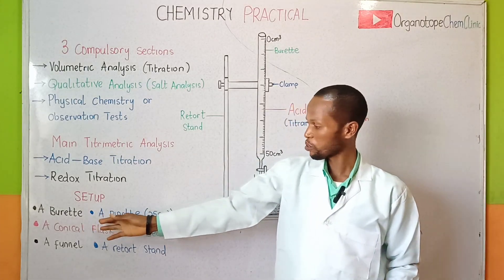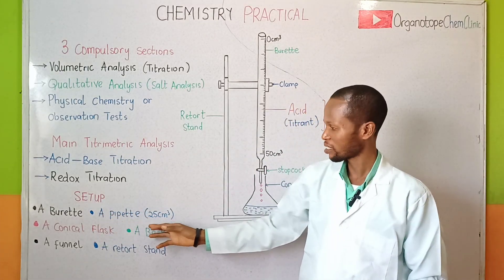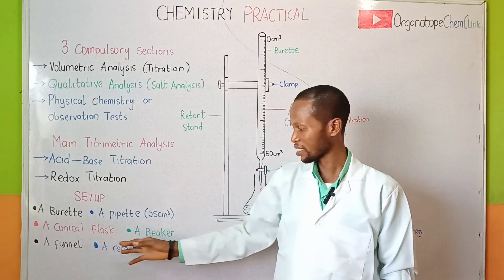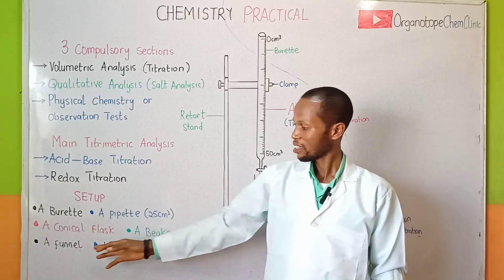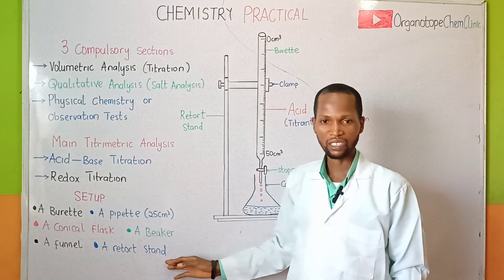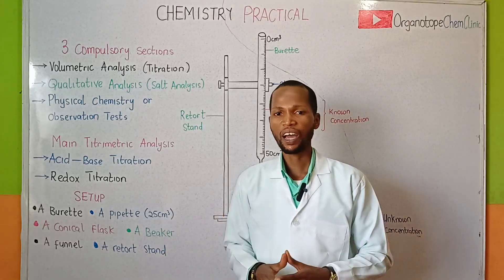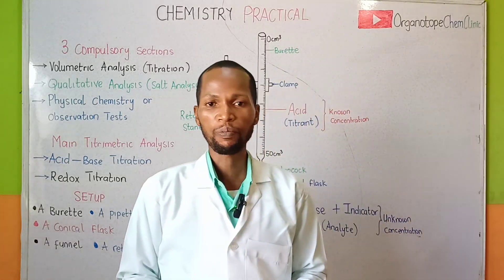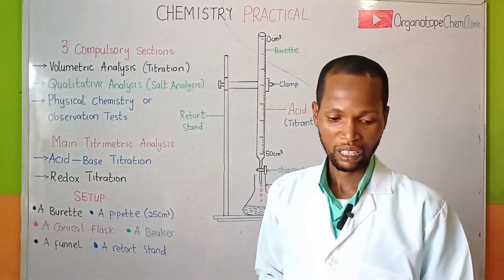Let's set up our titration station. Here is what you will need: a burette, a pipette, a conical flask, a beaker, a funnel, and a retort stand. We need to identify these materials one by one — can you identify your apparatus?